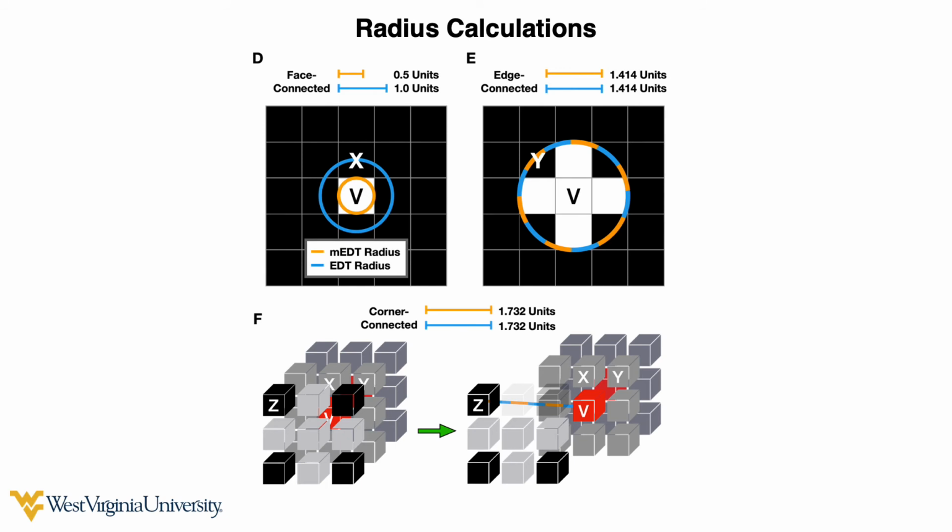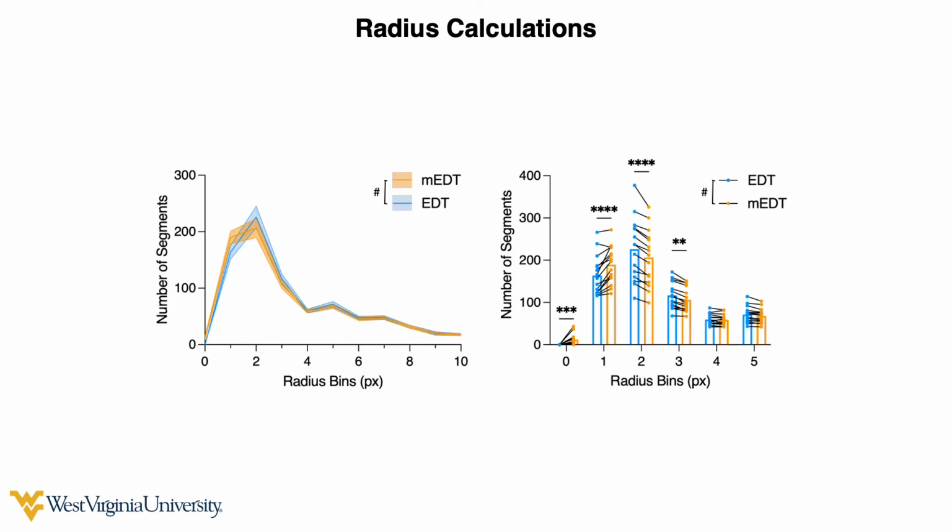Briefly, a half-unit distance correction is applied to non-vessel neighbors situated at the edge in 2D or face in 3D space. These corrections aren't applied for other types of neighbors. Through this modified Euclidean distance calculation, VesselVio is able to distinguish the presence of at-resolution vessels. Moreover, the resulting shift in vessel size reporting only occurs in small radius vessels.